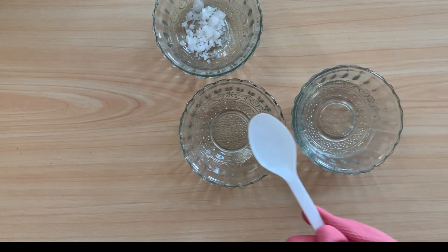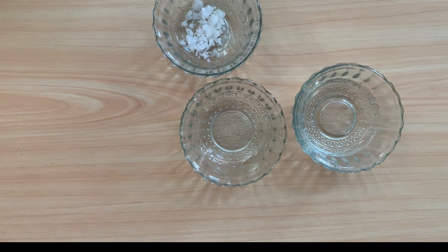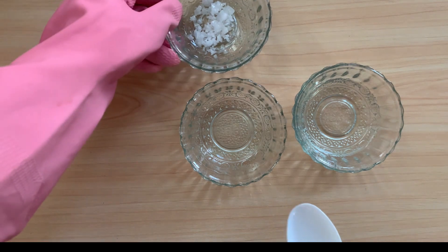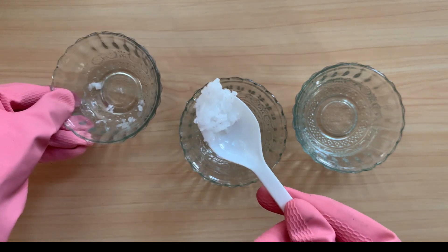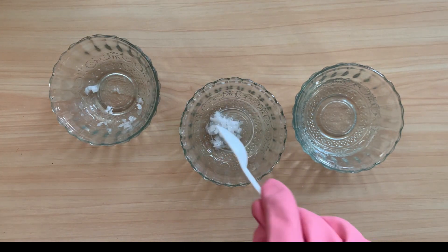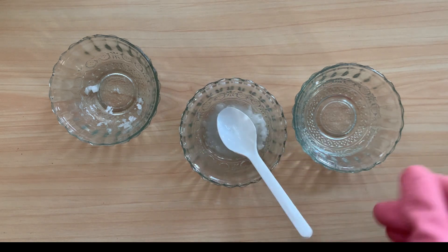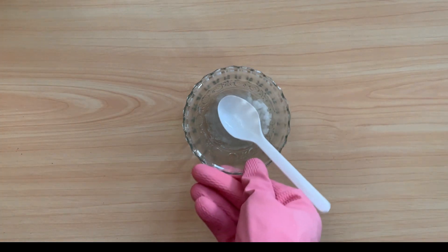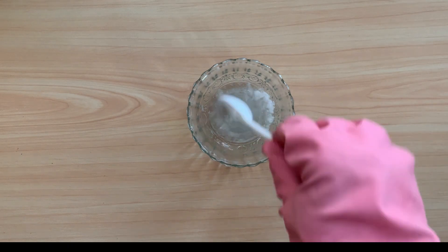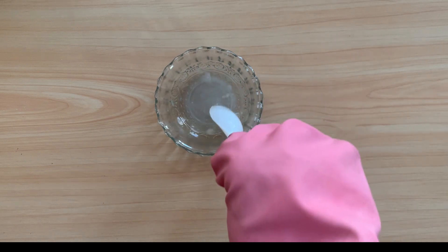First, take some water in the vessel. Then add caustic soda into the water. After that, mix it thoroughly until all the flakes of sodium hydroxide are completely dissolved in the water — not a single particle should remain undissolved.